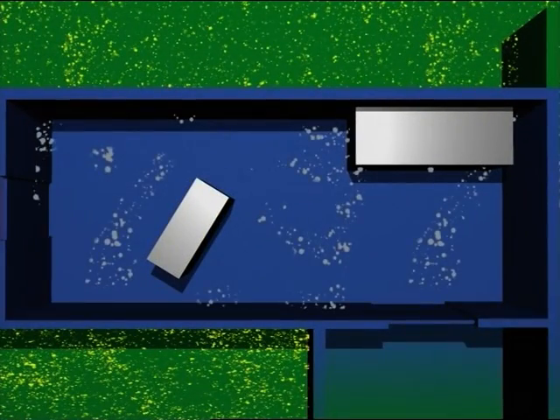How is this decided? In order to create the same rules and regulations for all companies, clean rooms are divided into different classes, depending on which production demands have to be satisfied. And this classification is based on the highest number of particles and microorganisms that are permissible in the air and on the surfaces. Classes A and B demand sterile conditions, that's to say virtually no microorganisms at all. So-called microorganism-reduced conditions are required for classes C and D. That is still far cleaner than in our normal surroundings.